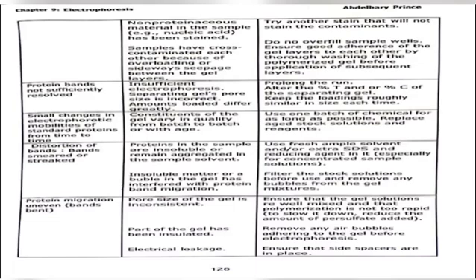Problem: small changes in electrophoretic mobilities of a standard protein from time to time. Cause: constituents of the gel vary in quality from batch to batch or with age. Remedy: use one batch of chemicals for as long as possible. Replace aged stock solutions and reagents.